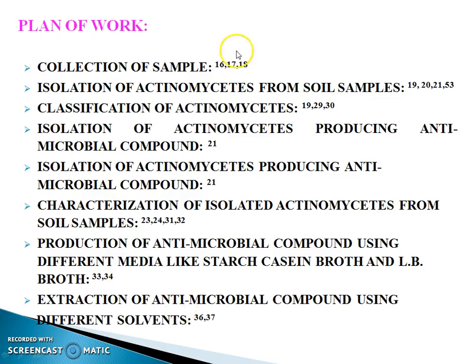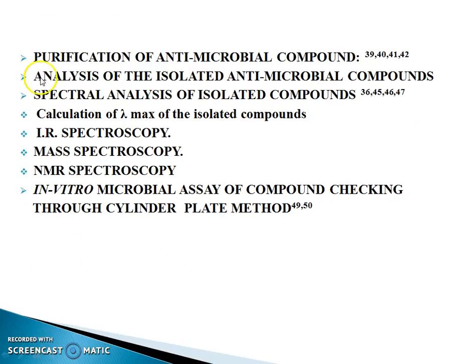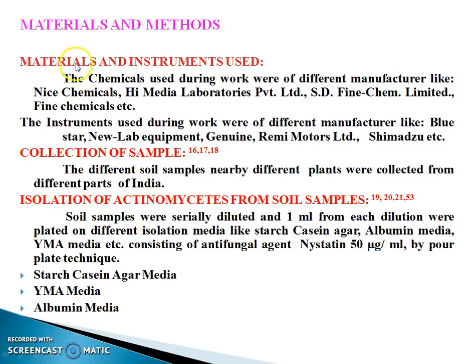Then the plan of work: first collection of samples, then isolation of actinomycetes, then classification of actinomycetes, then isolation of antibiotic-producing actinomycetes, producing antimicrobial compound, and then extraction, and at last purification of the compound was performed. And then these are the materials and methods.